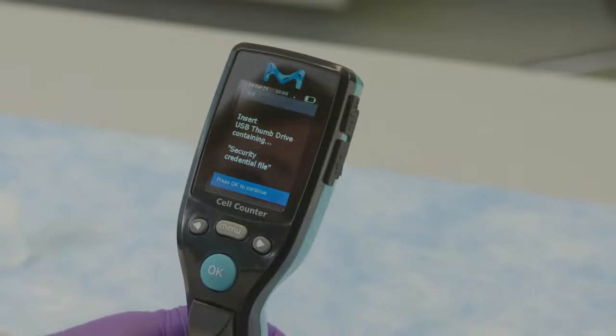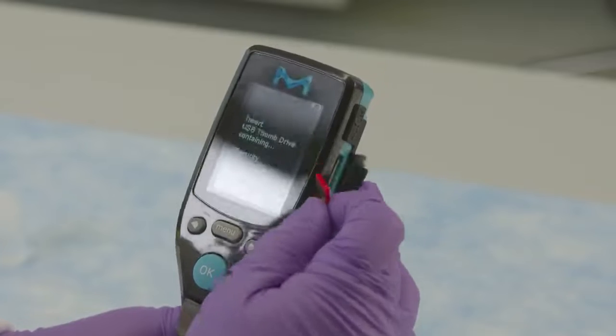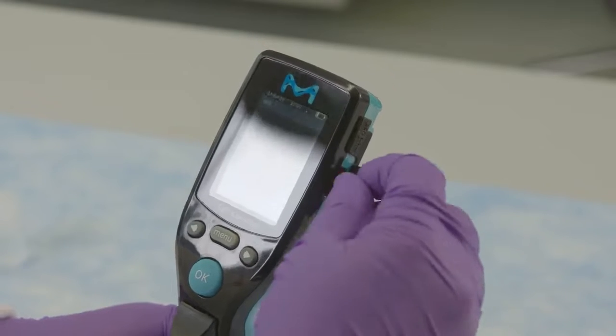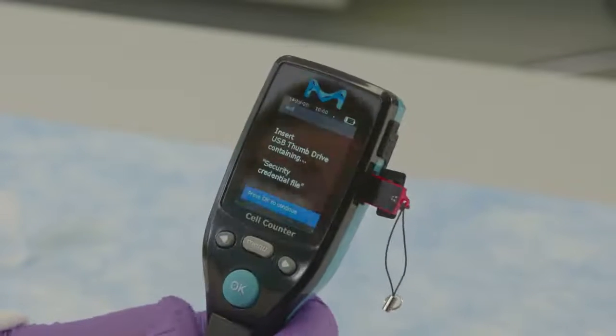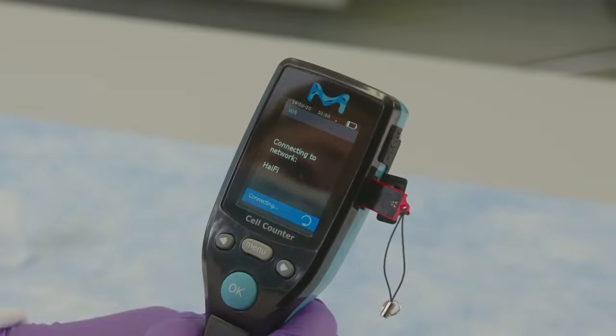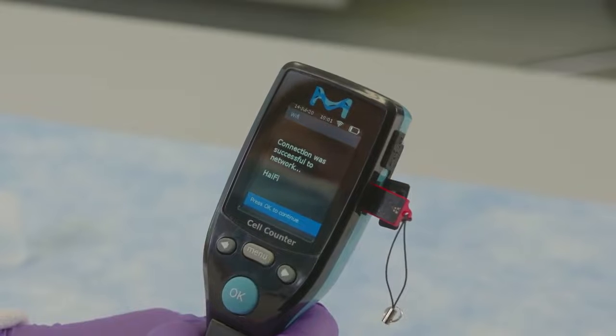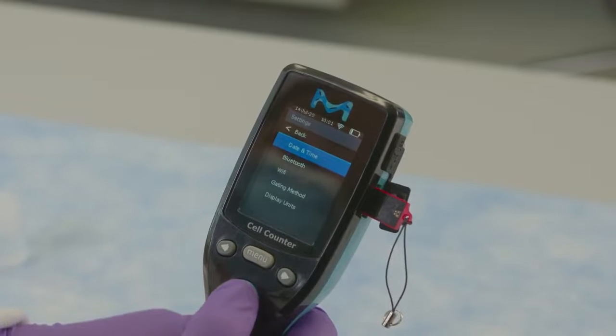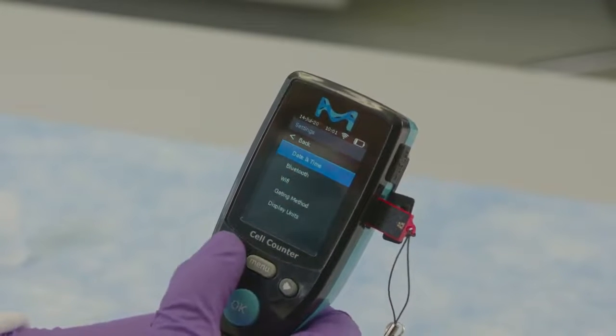When prompted, insert the USB flash drive into the SEPTOR 3.0 instrument USB port containing the credential file for the Wi-Fi configuration. When connection is complete, the screen will confirm successful connection. Press the OK button to return to the settings menu and remove the USB flash drive.